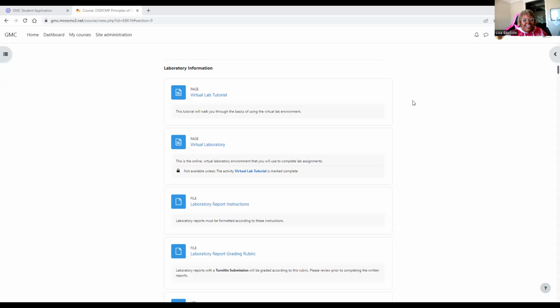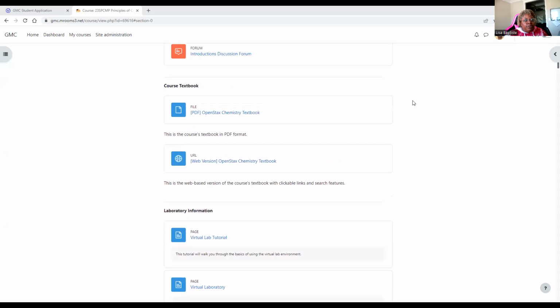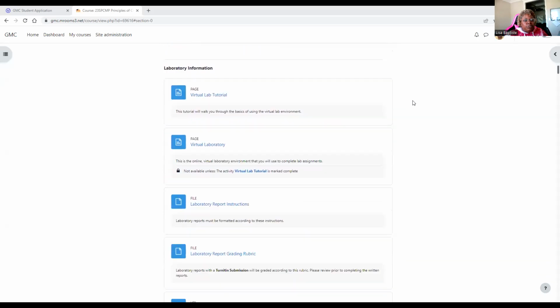Hello, class. I wanted to do this tutorial to help you navigate through the virtual laboratory for at least the week one lab experiment. And so let me start by showing you. So this is the Moodle home screen.